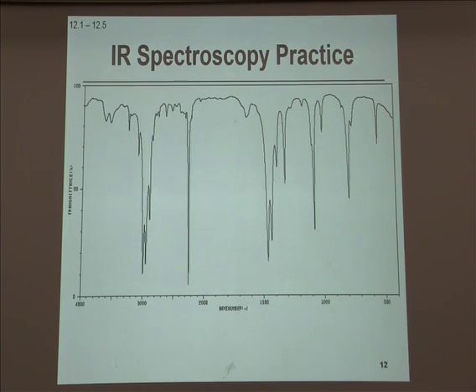So I want to talk through about 4 examples of some spectra and what you should see in them if you don't know what the molecule is. This first region on the far right is the fingerprint region, and we're going to sort of ignore and not worry about too much. This is the big feature in this spectrum that I think is useful. It's in the triple bond region, and so it tells us there's probably a CC triple bond or a CN triple bond in the molecule, and we can actually go one step further. This is almost certainly a CN triple bond.